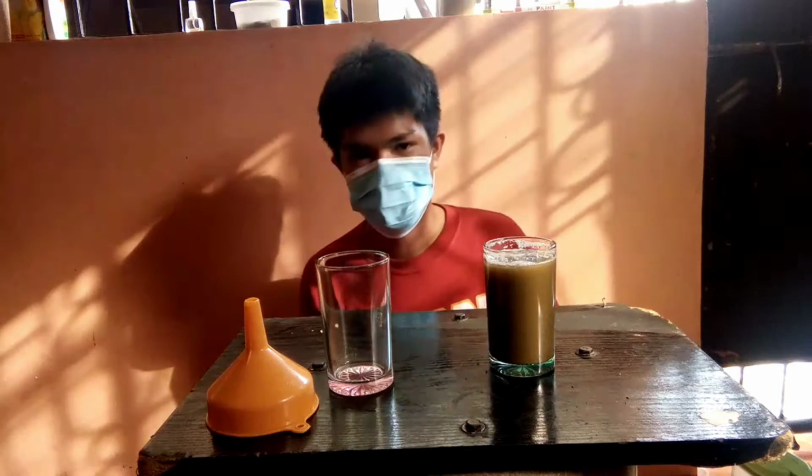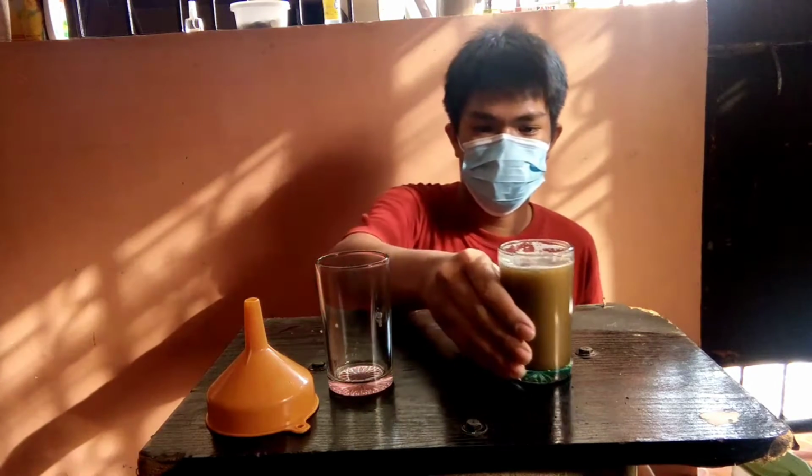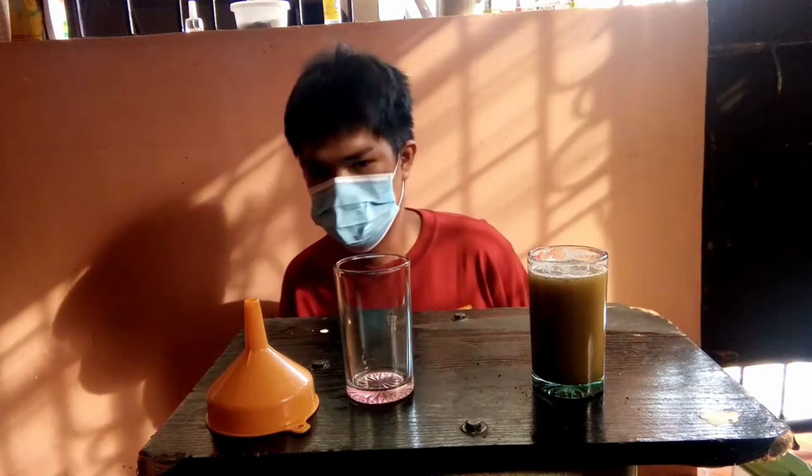Now we have the dirt and water mixture. So we're going to separate this using the filtration method.